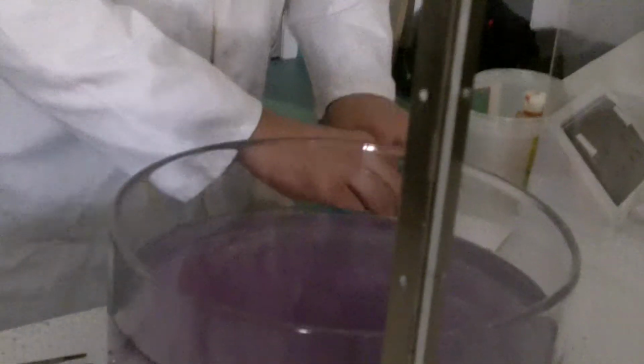We'll just check. I'll get people to stand back when I do it because I've never done it before. Actually, I haven't done a risk assessment on it. I don't even know exactly what's going to happen. Who cares about risk assessment? We can cut it afterwards. Alright, we'll leave that. We'll do it with these while we've got this out. Okay, we have lithium, sodium, potassium right there in order. Stand back, everybody.